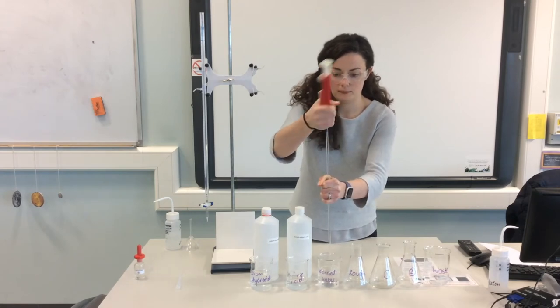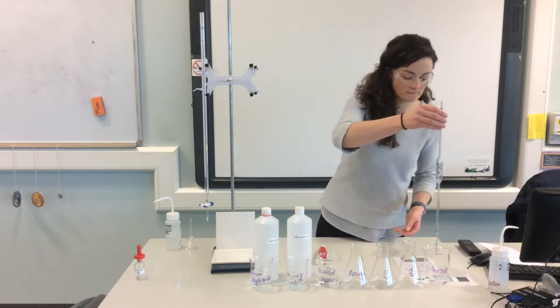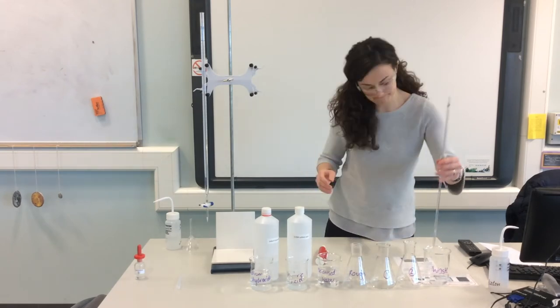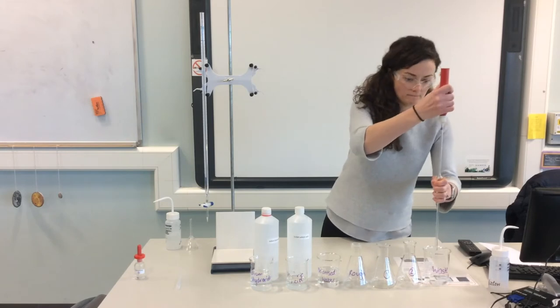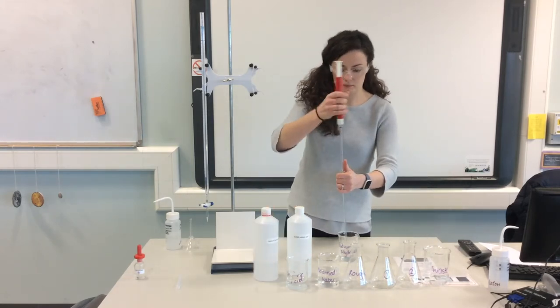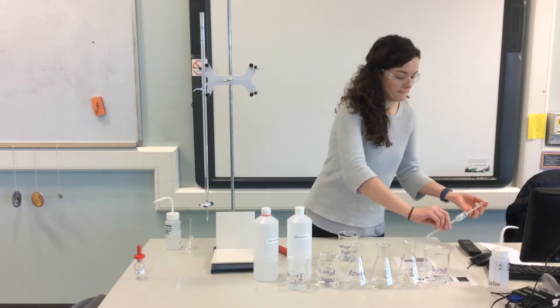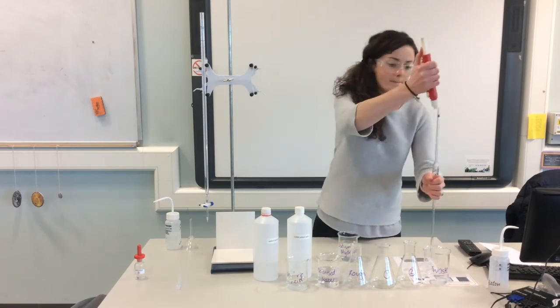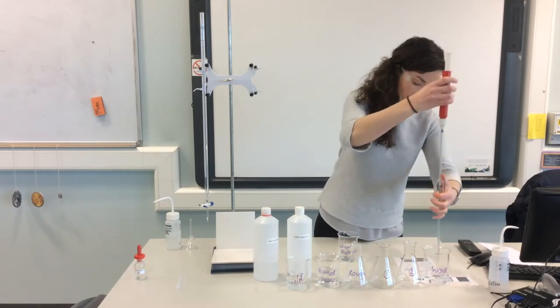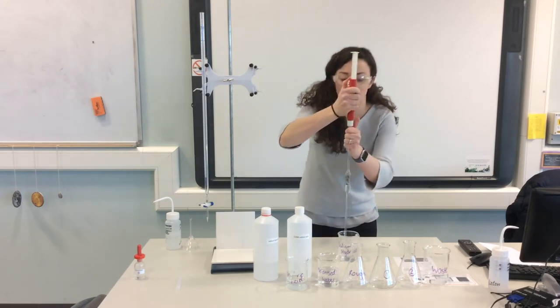Now what we're doing is rinsing our pipette. First of all with deionized water, sucking up a little bit of deionized water, again rinsing the inside of the pipette with that and removing all of the water. And then you want to rinse it next with the solution you're going to be filling it with. In this case it is sodium hydroxide, again partly filling it and rinsing the inside of the pipette with the sodium hydroxide and pouring it into a waste beaker.